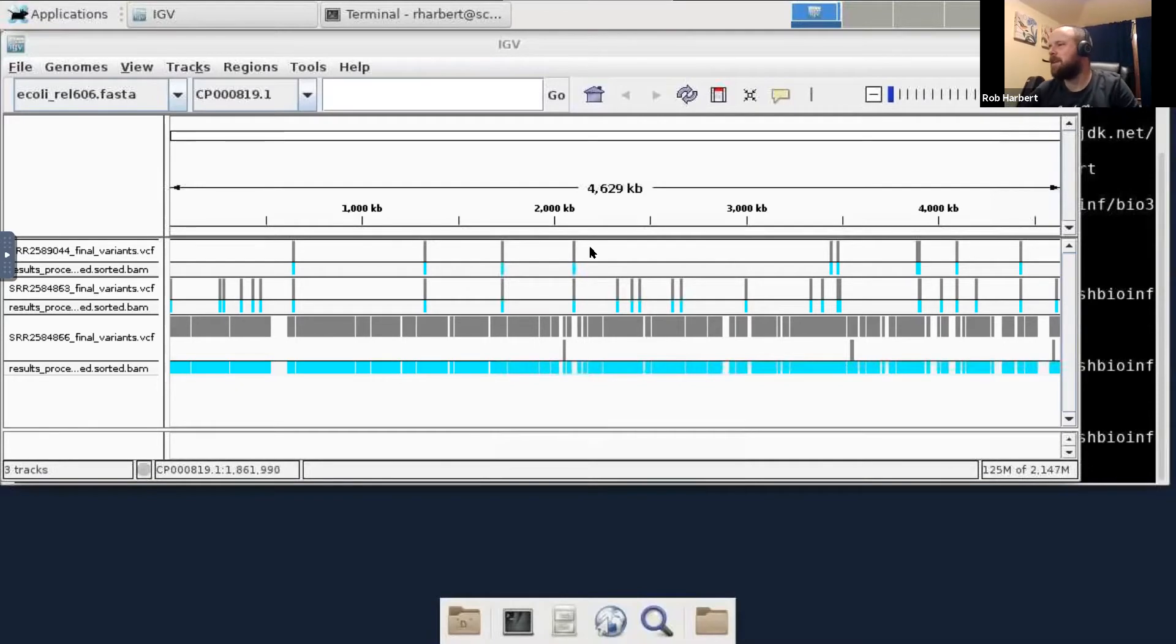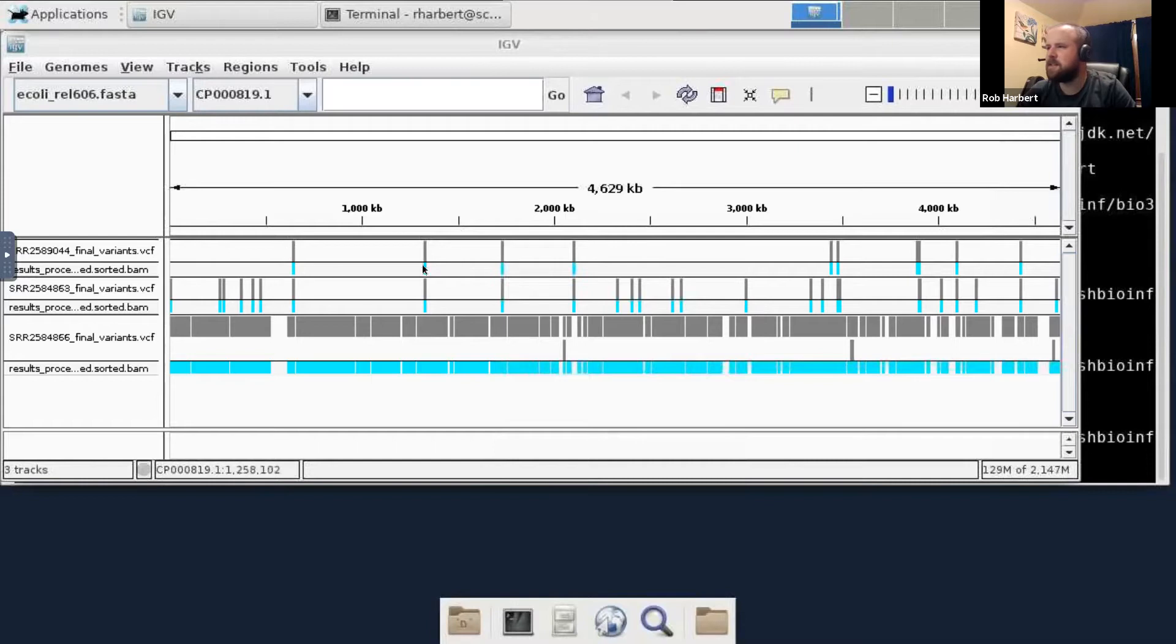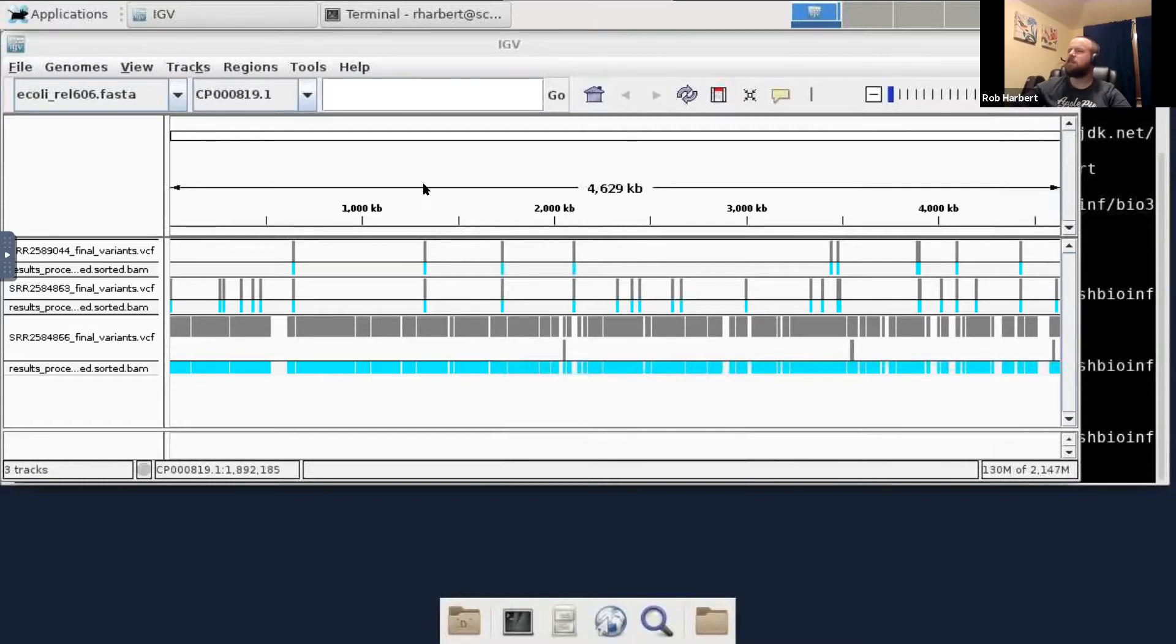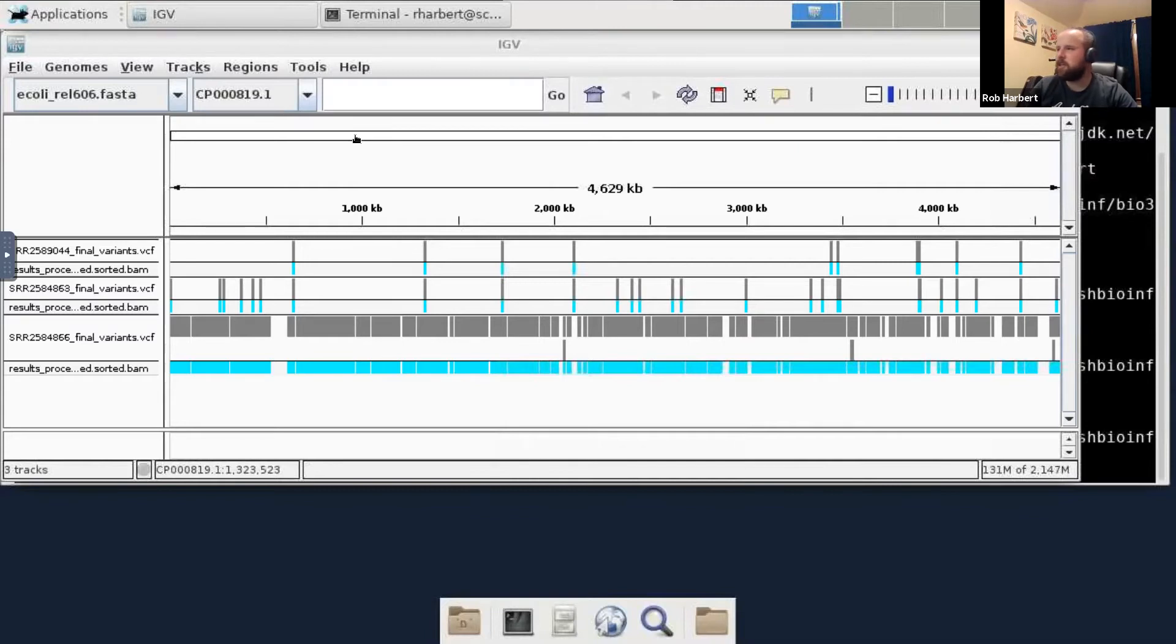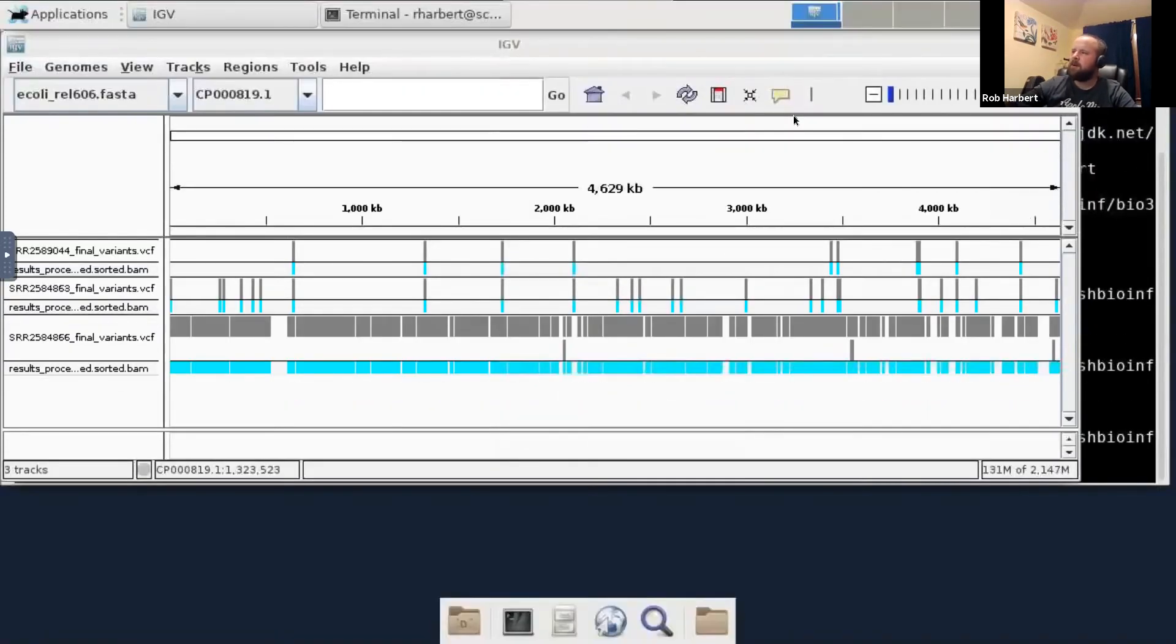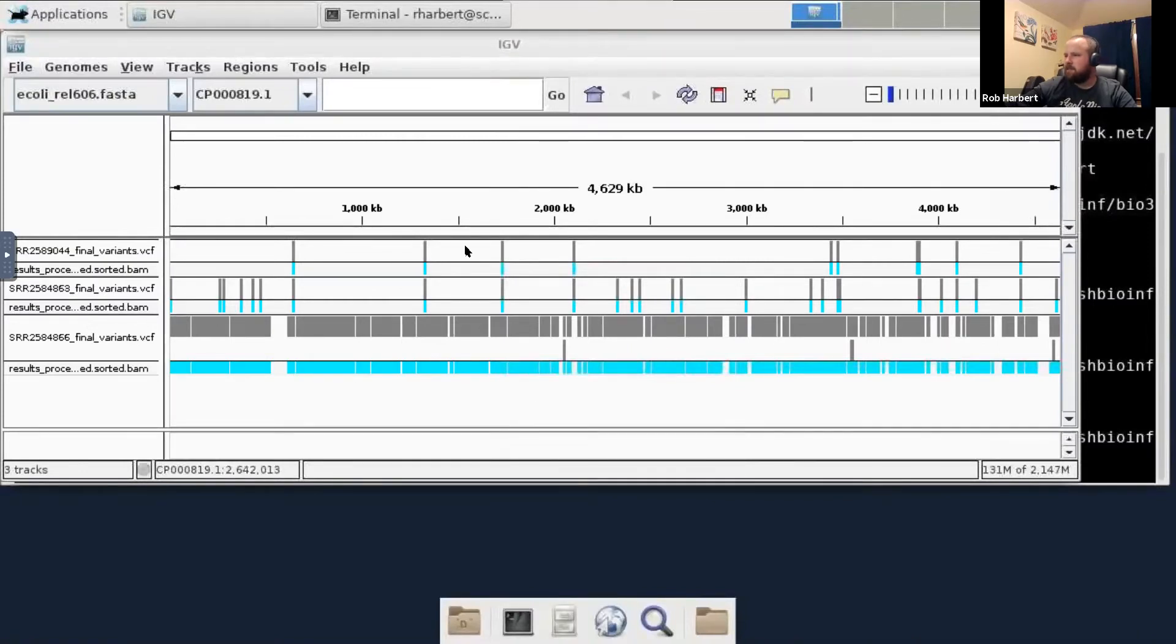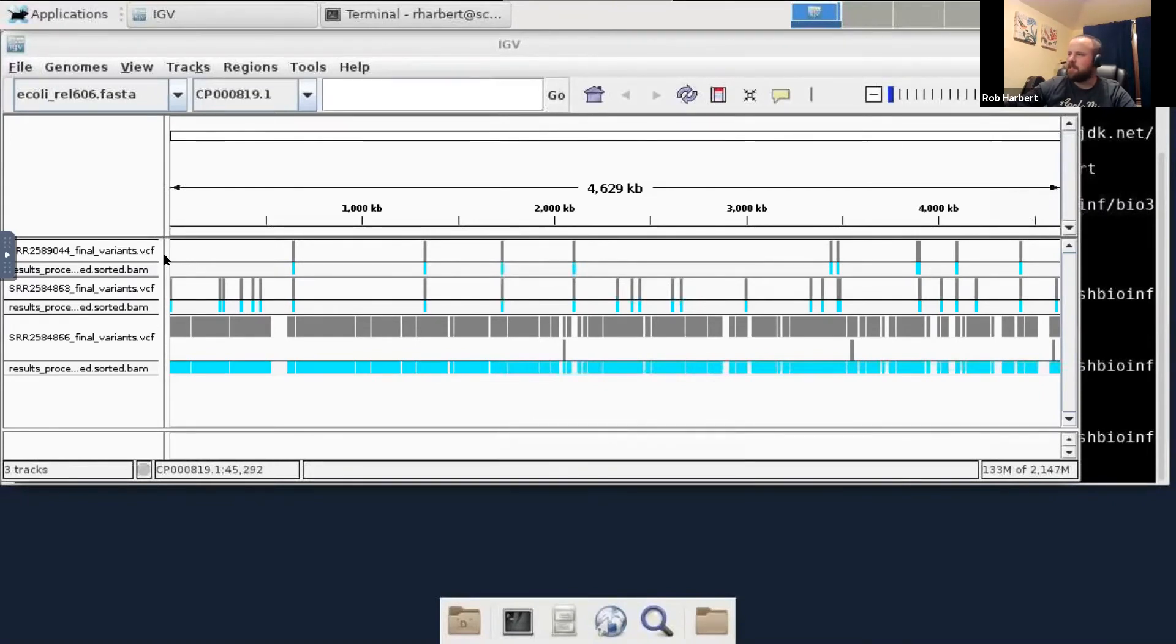We could go through and investigate. We could see there's four variants here between the first two that are the same. What are at these sites? Are these falling in genes? Are they changing anything about the genome? This opens up a whole new line of investigation for your project. That's the cap on our variant calling workflow. We've gone from raw data to something we can start to explore and start to learn about the genome that we've been sequencing with our raw data here.